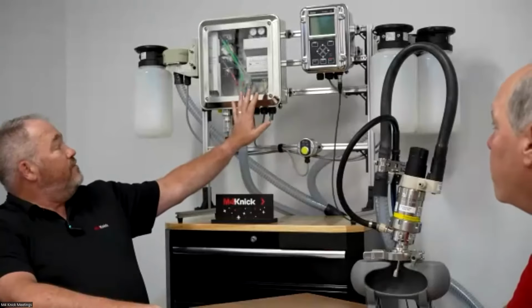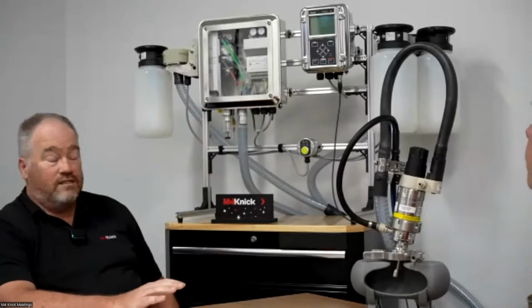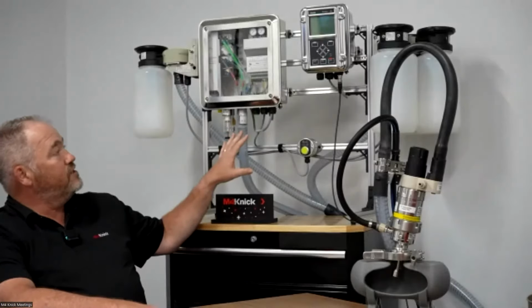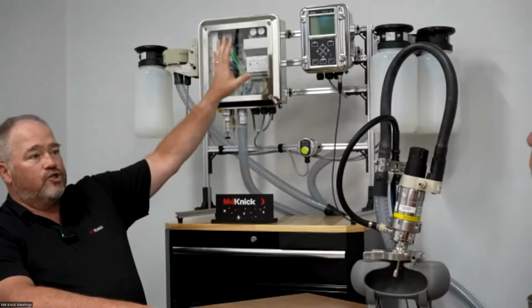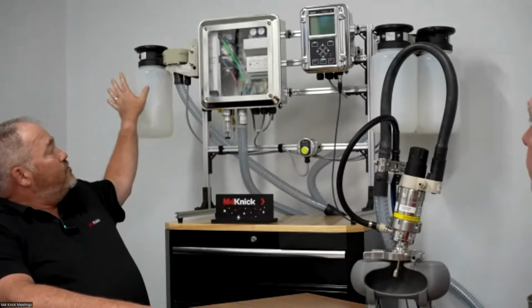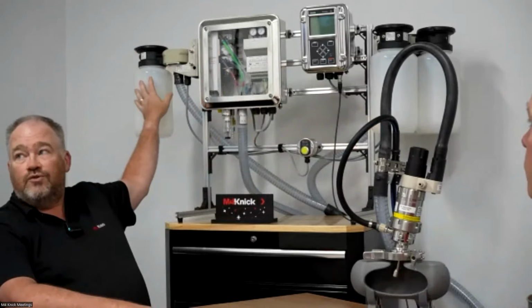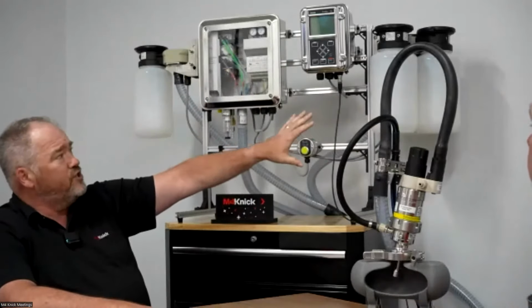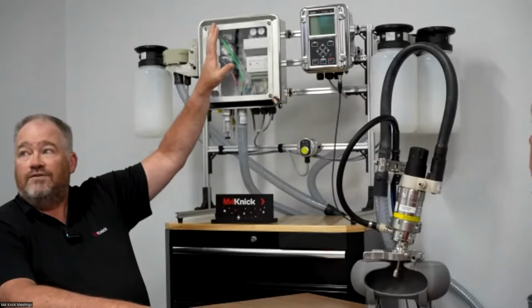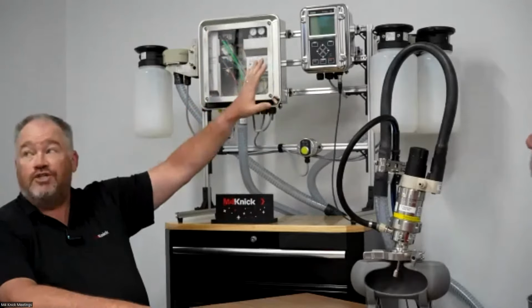So before we get into some of the topics, we want to use this as a visual aid. This is an example of a fully automated system. We call this our C-Care system. I'm just going to give you a quick tour of what this is showing you. I'm going to start with the outside bottles here. This is where we would hold cleaning solution and calibration solution, because this system is fully automated for cleaning and calibration.